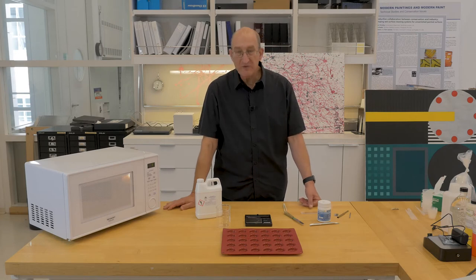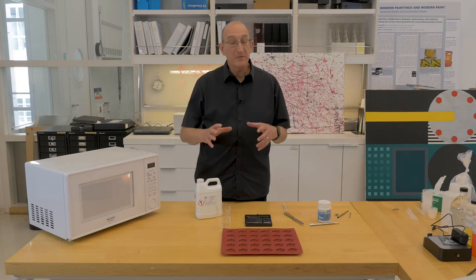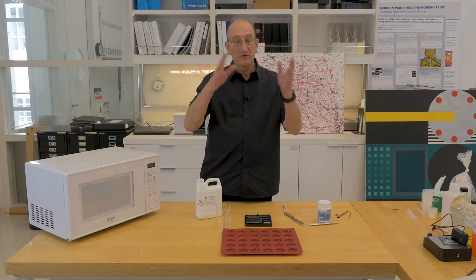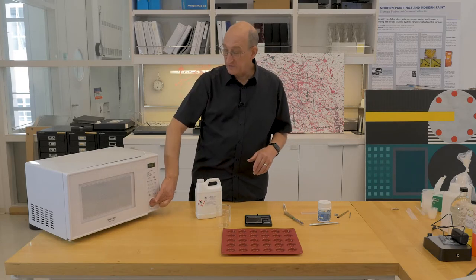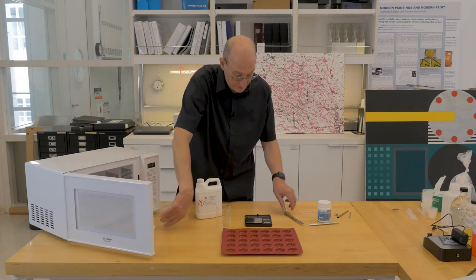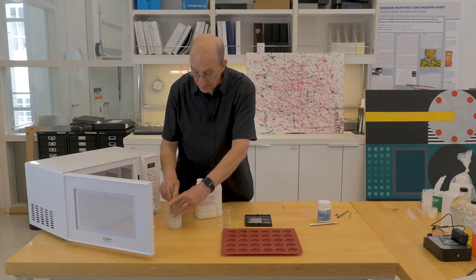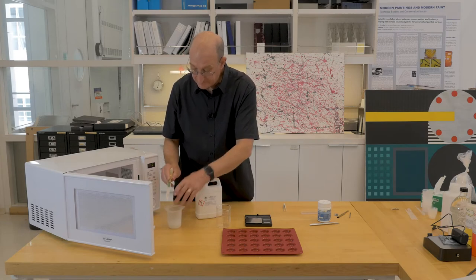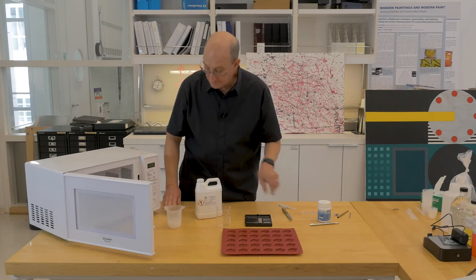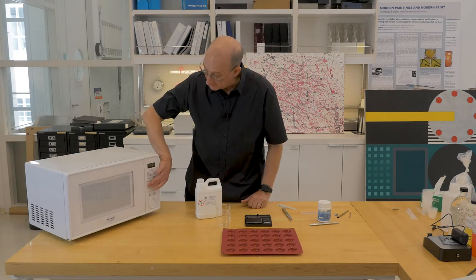You have to be very careful because the agarose can superheat and bump, so it can boil over very quickly. You don't want to get boiling agarose on your hand. It's starting to get warm now and starting to thicken up. So we'll do another 10 seconds.